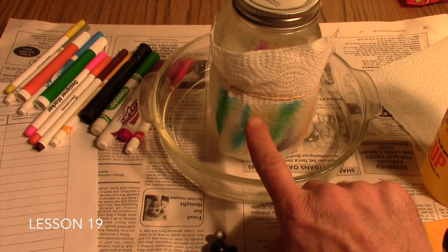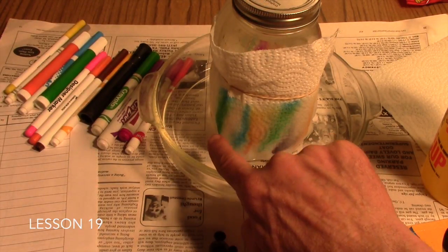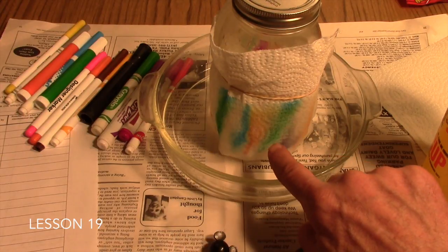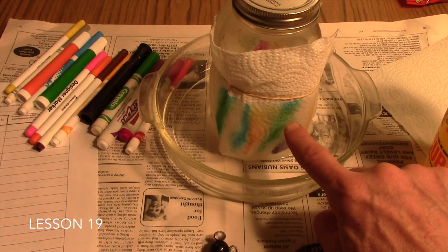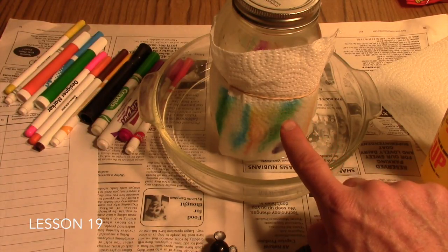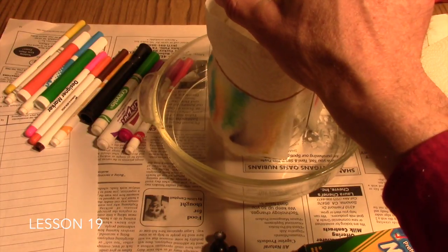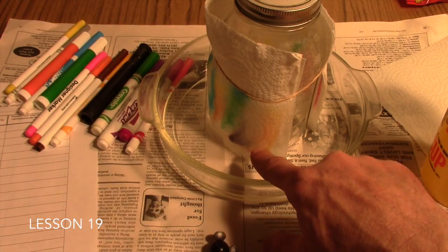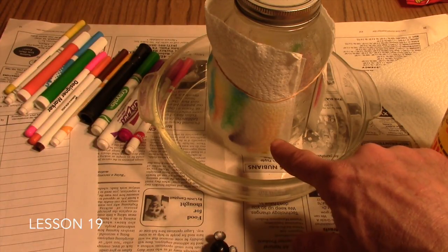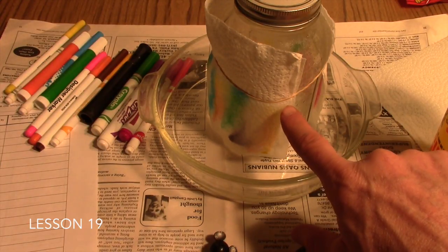As the front line moves up, you can have your students observe. These were two spots here from the same color green, same pen. And you can see we've got most of the green pigments staying down behind. Up at the front edge, we've got a set of blue pigments that are traveling much farther than the greens. These were some spots from an orange marker, and you can again see we've got some orange pigments down here, and the lighter colored inks are traveling farther.